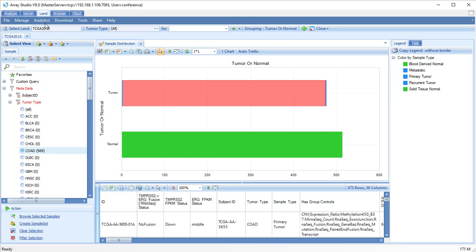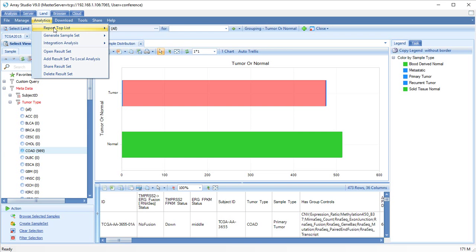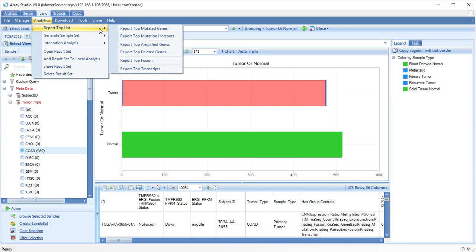Now click Analytics, Report Top List, Report Top Mutated Genes.